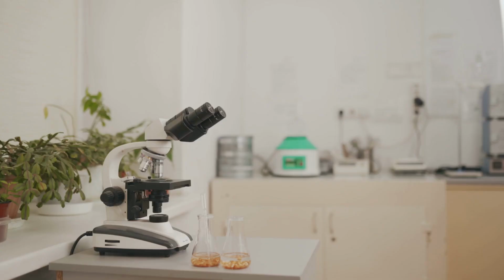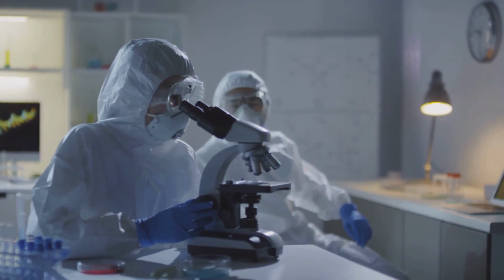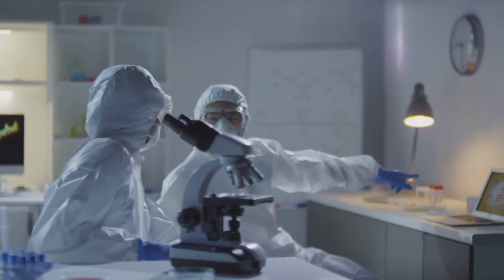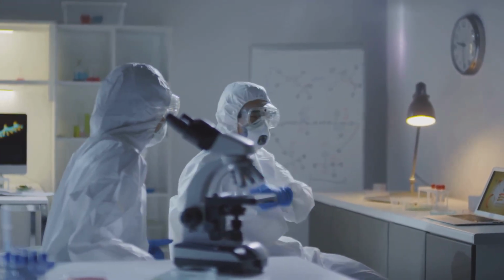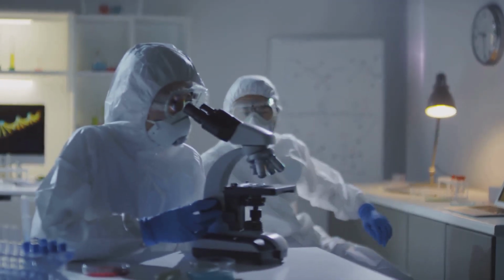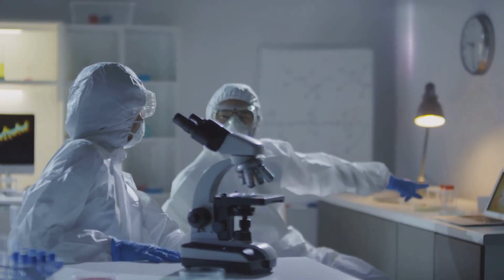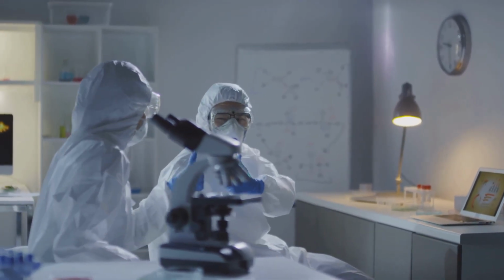There are two main types of electron microscopes. The first is the transmission electron microscope, or TEM. In a TEM, the electron beam passes through an extremely thin slice of specimen. Electron gun, magnetic lenses, specimen, final image on a screen. It's like a superpowered version of a light microscope.